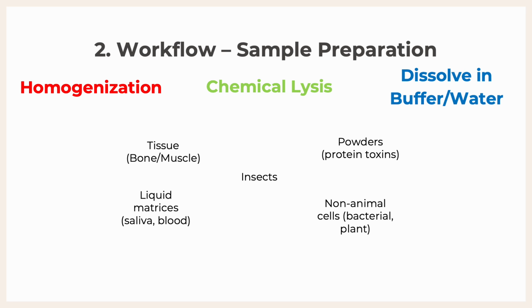More delicate is chemical lysis. So this is when you're using water or buffer to essentially explode the cells to get your proteins out. And finally, dissolving in buffer and water, which is the most intuitive. You're just literally adding buffer and water to your sample.